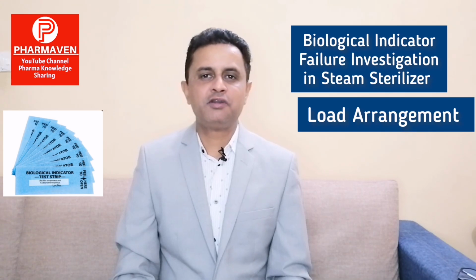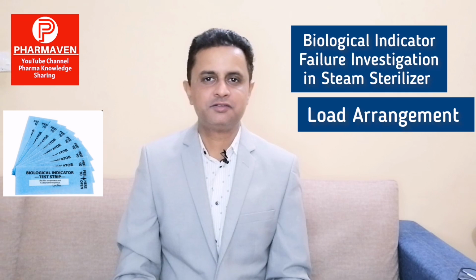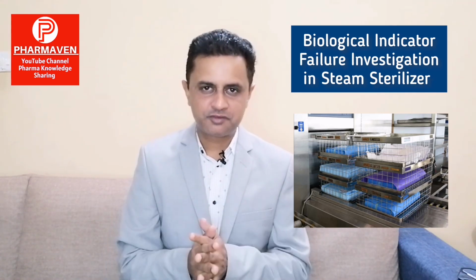In case the load is new or we are going for the requalification, just check how we have arranged the load and why load arrangement is important. In order for steam to flow freely inside the chamber and between the load items, we need to place the load in such a way that it allows proper steam distribution inside the chamber between the loads. It allows proper steam penetration.